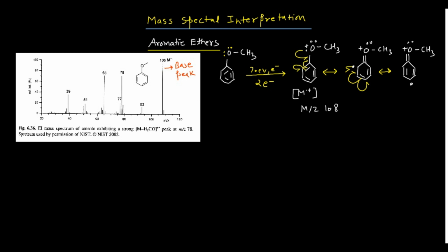I hope you understand how I am moving these electrons, right? First of all, I broke this particular bond and one electron shifted here. That's why one odd electron is here. One is going up, other one is coming from this oxygen. This will make a double bond, because for the formation of the single bond, you need a pair of electrons, and here we are getting the pair of electrons, right? So this is how I have generated this structure.